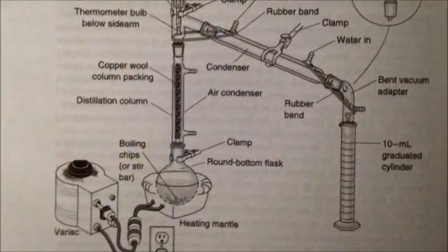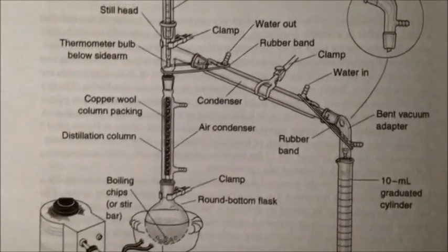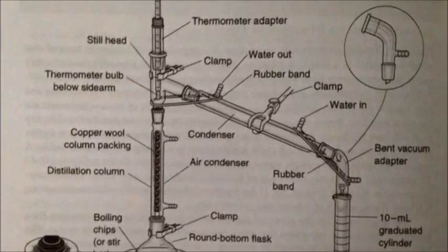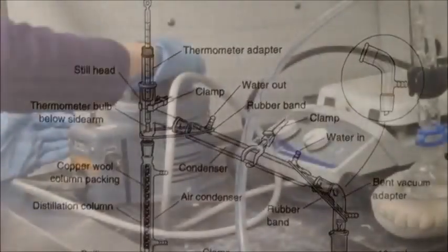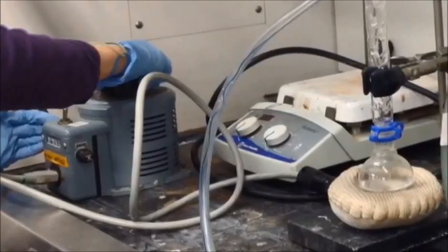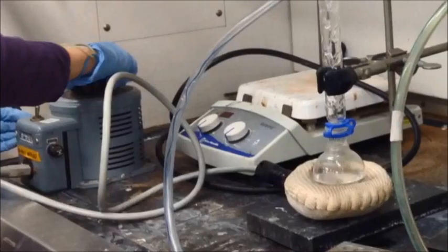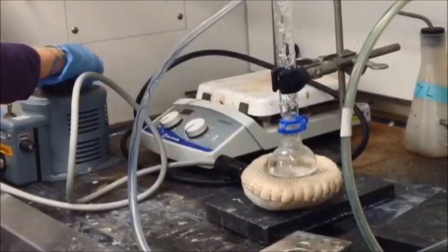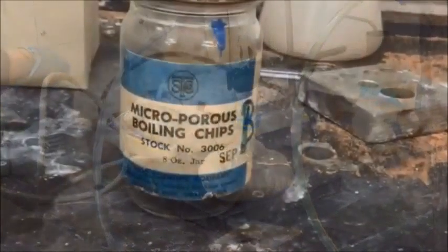Now the fractional distillation apparatus is composed of several parts: the variac, heating mantle, round bottom flask, distillation column, stillhead and thermometer, condenser, bent vacuum adapter, and 10 milliliter graduated cylinder. The first piece is the variac, which basically acts as a power source for the heating mantle, which is the source of heat. The mixture of your liquids, in this case a mixture of 20 milliliters of ethanol to 30 milliliters of water, is going to be placed in a round bottom flask, and this is where all of the boiling takes place. We've added some boiling chips to speed up the process.